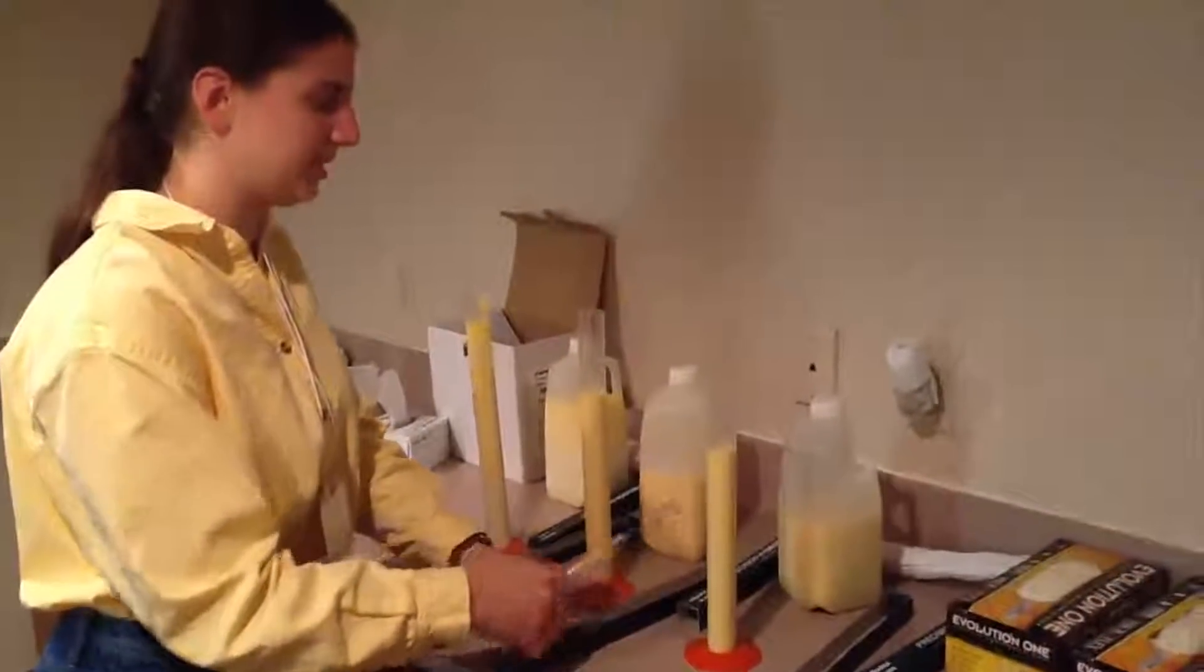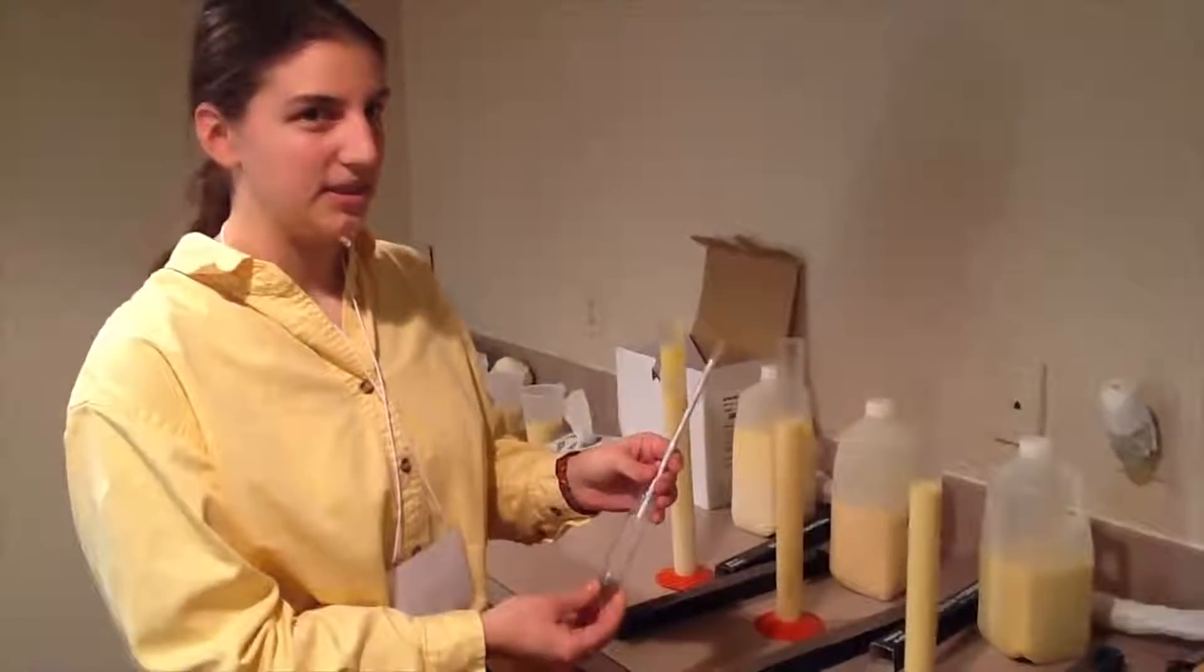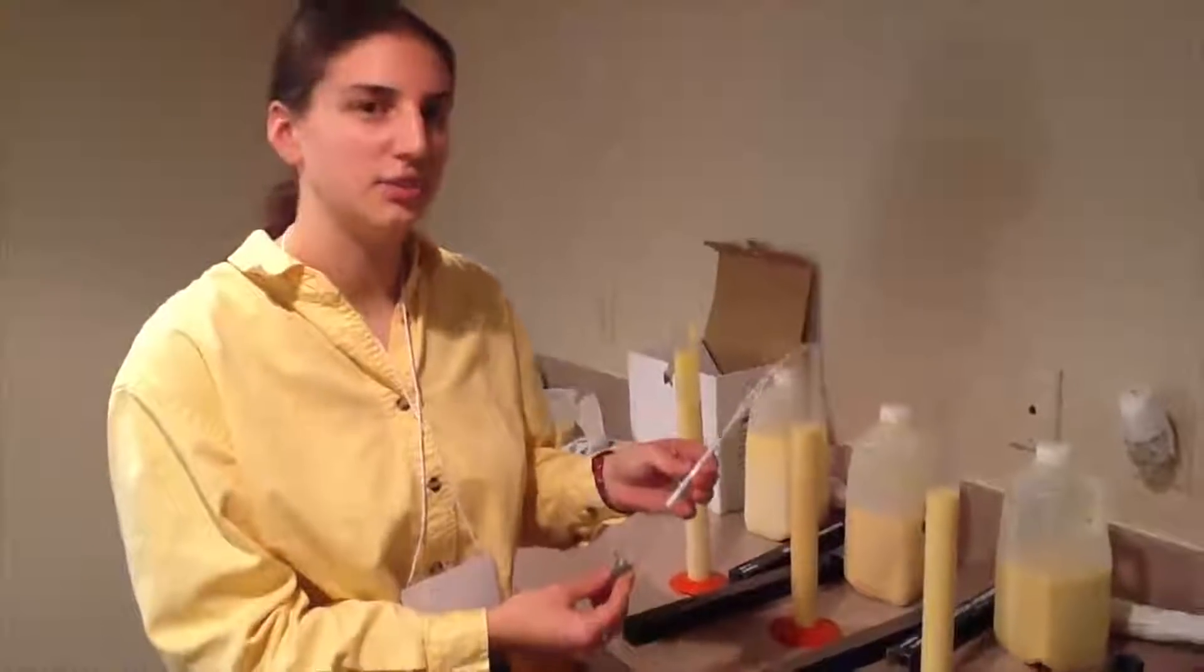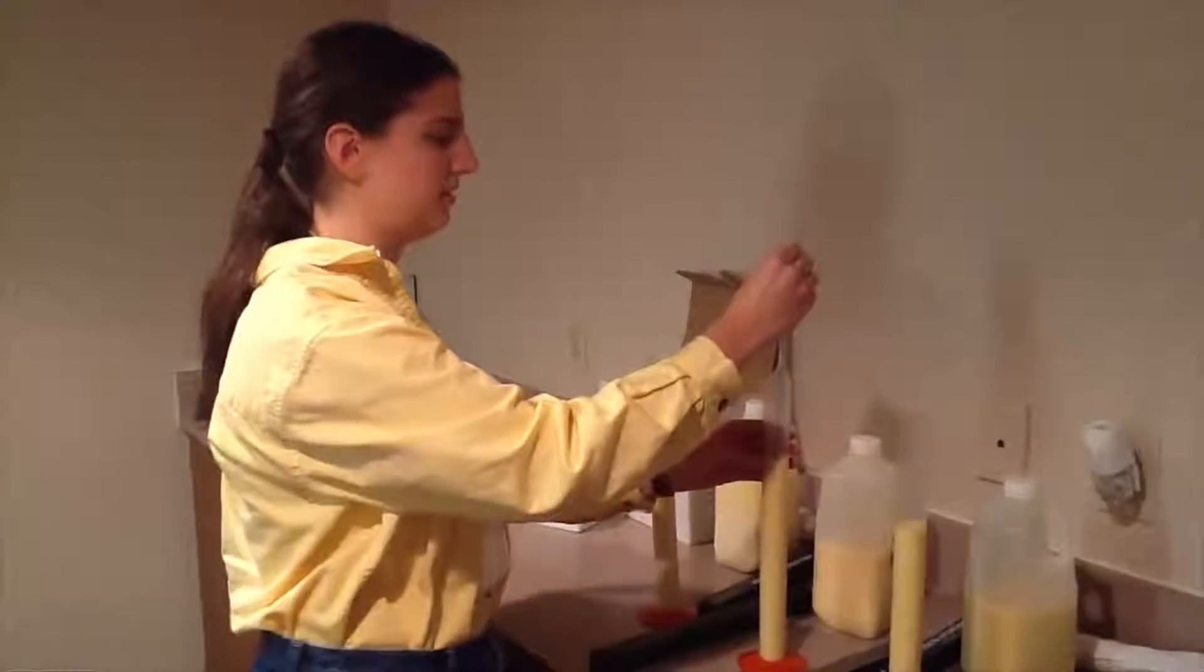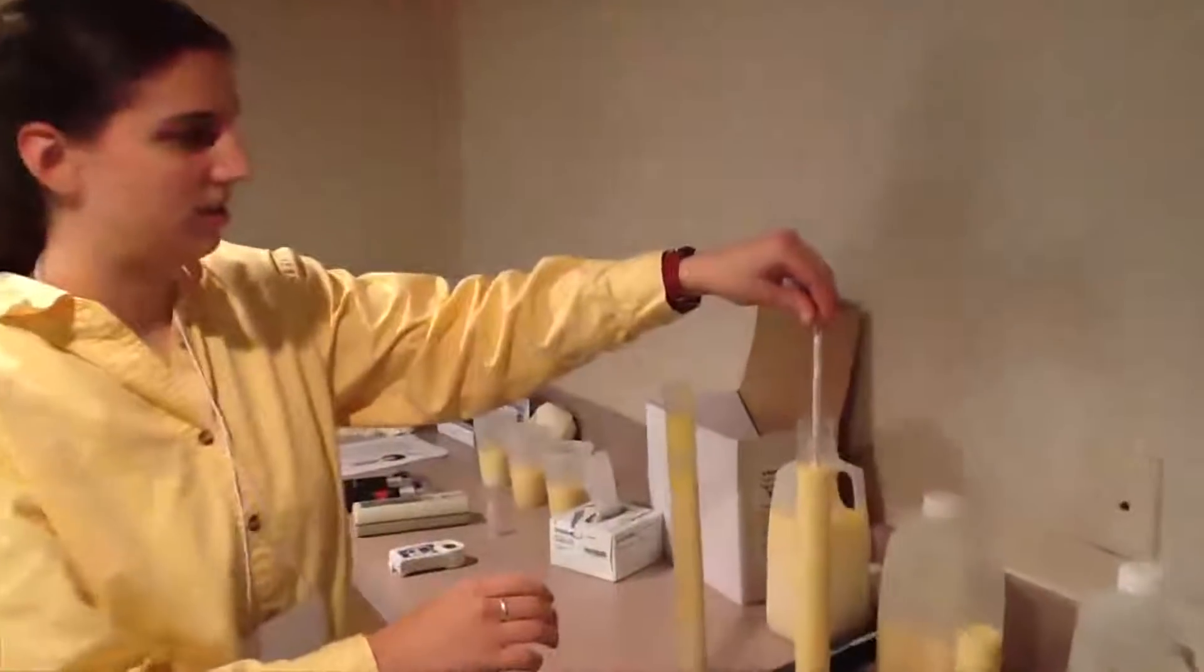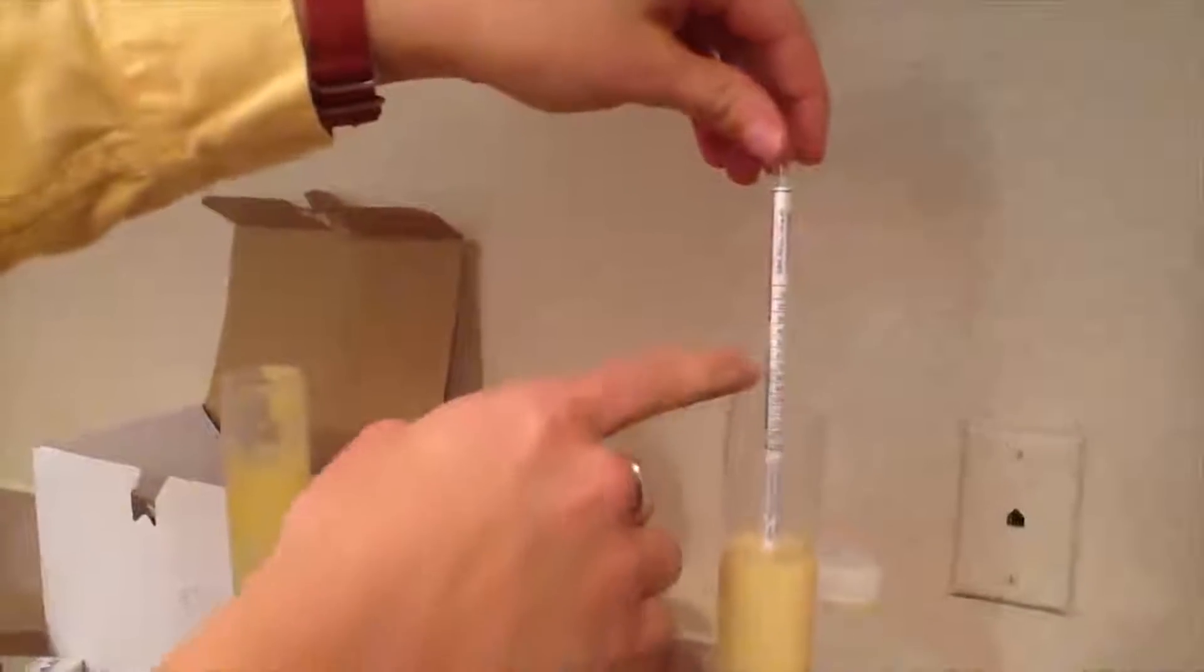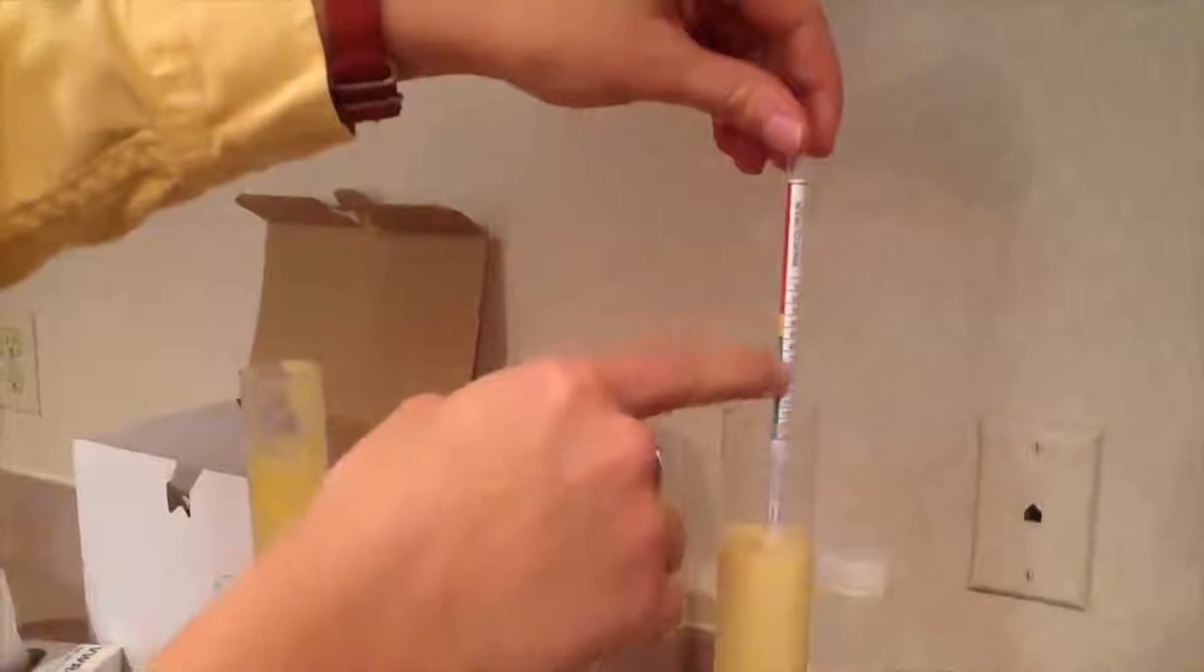So one of the first things that a lot of dairy farmers use is the colostrometer. This measures the IgG level of the colostrum and it's based on density. All you need to do is drop the colostrometer in there and let it sink, and then there's a scale on the actual colostrometer. The goal is to be higher than 50, and you can see the green actually correlates to higher than 50. So if it's in the green range, it's good quality colostrum.